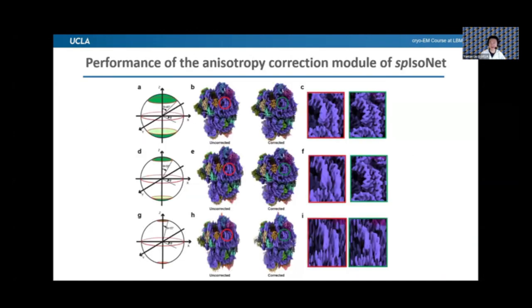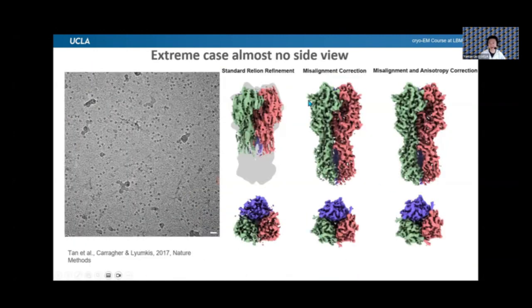This should be okay without the reference map. And if you really encounter a problem like this, where you cannot get a structure at all, it's completely wrong, then this is a case where you want to use the reference map. So if your structure is not good at all, you probably want to tilt it to create a very small set of data, maybe just 20 degrees of tilt, to make the structure roughly correct, and then this should be fine for the IsoNet training.